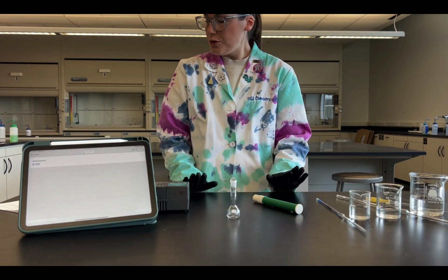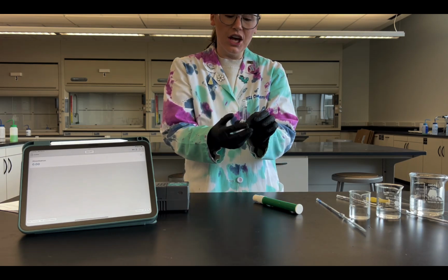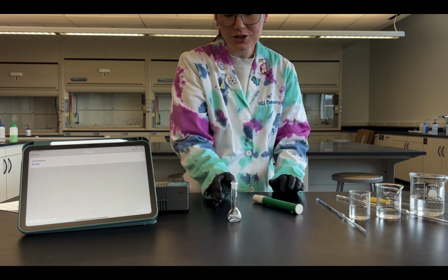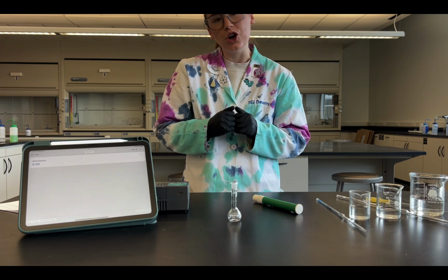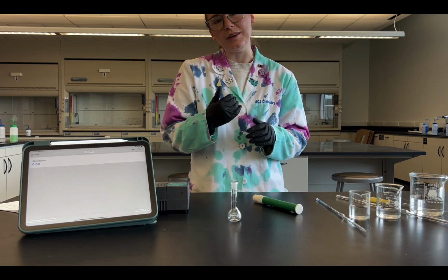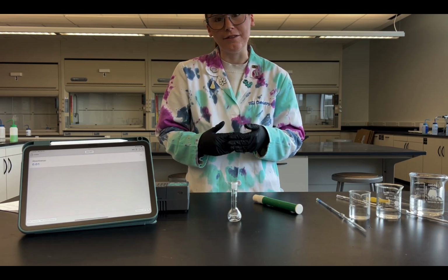So the way we are changing in this dilution is we are now just using 10 milliliters instead of 25 milliliters. So I again have a 10 milliliter volumetric flask, which is smaller than my 25 milliliter volumetric flask that I used in the previous part. For this part of the video, I'm only going to show one test tube, how we make it, how we find the absorbance from it, and when we get into our calculation section, how we can use that to fill in our ICE table and find our K value.